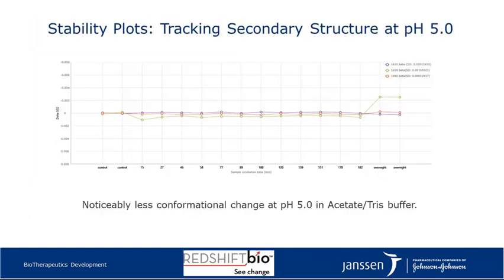So as I mentioned, we also ran pH 5, and this experiment was performed in the same way, that the acetic acid was added to the sample in bulk and the sample distributed across the plate. And this experiment shows that, again, over time, there wasn't a huge change in the structure of all the samples.